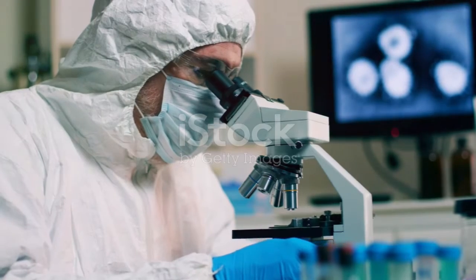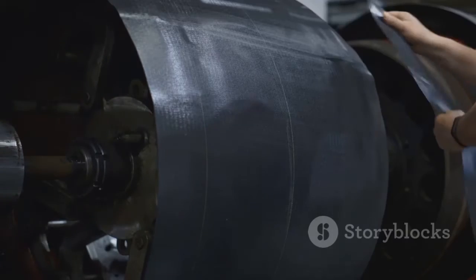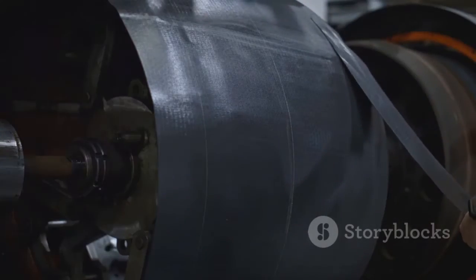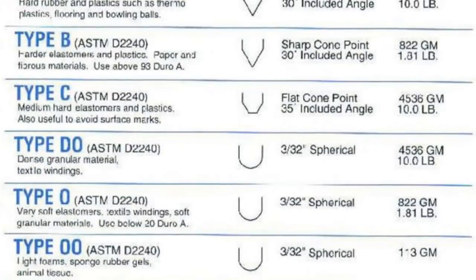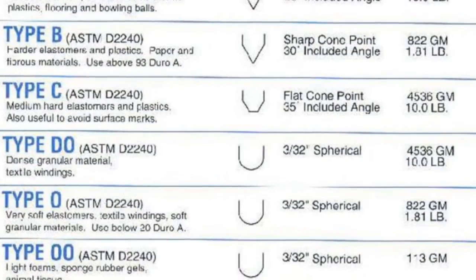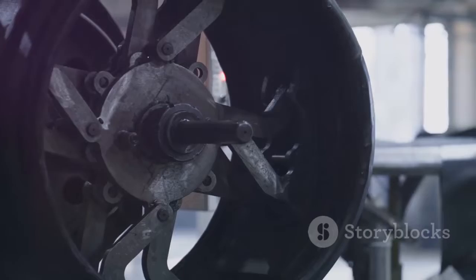engineers and scientists use to measure rubber hardness. It's based on the penetration of a specific type of indenter when forced into the material under specified conditions. The indentation hardness is inversely related to the penetration and is dependent on the elastic modulus and viscoelastic behavior of the material. This method is unique and stands apart from other methods of measuring hardness.